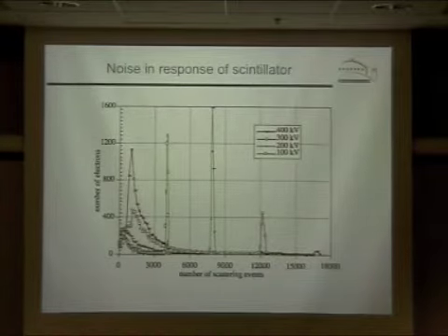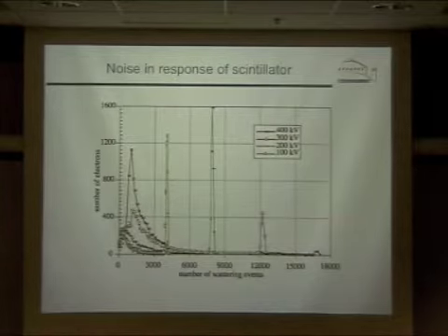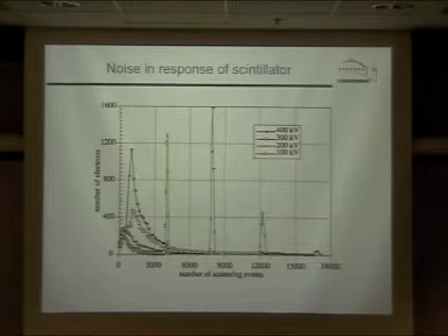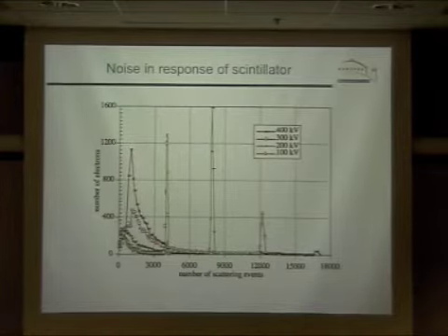So this is a noise source that had been appreciated in medical imaging, but I think people in electron microscopy were really slow to identify this as a limiting factor. That's a noise source in addition to shot noise that looks a lot like shot noise, but is not something that, like shot noise, would be limited or decreased by the MTF of the detector system. So this is noise in the detector. It's not noise coming into the detector that gets filtered or smoothed out by the detector.